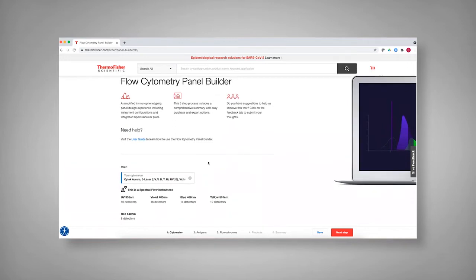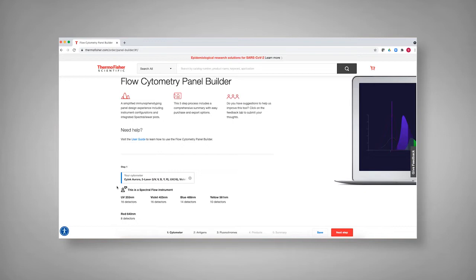If you wanted to look at other instruments, the Bigfoot is available as a spectral instrument, and each of the auroras with the different lasers, as well as conventional instruments. The panel builder knows whether you're selecting for spectral or for detector-based, conventional panel design.